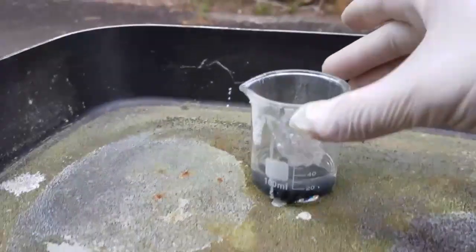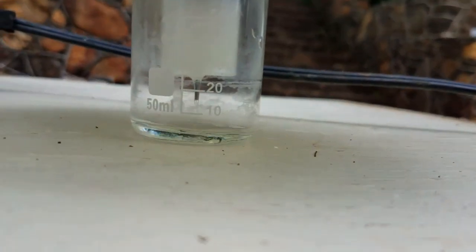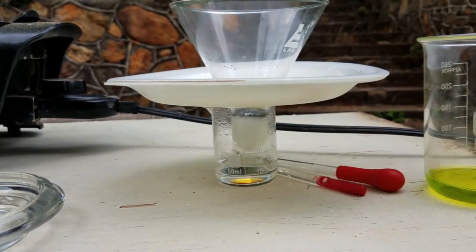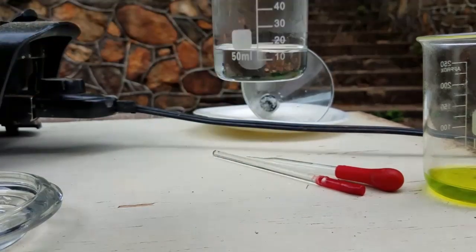There's some dirt on the glass, so now I need to filter the solution. This residue from the tin I will wash and use again next time — I just need to wash it in clean water.